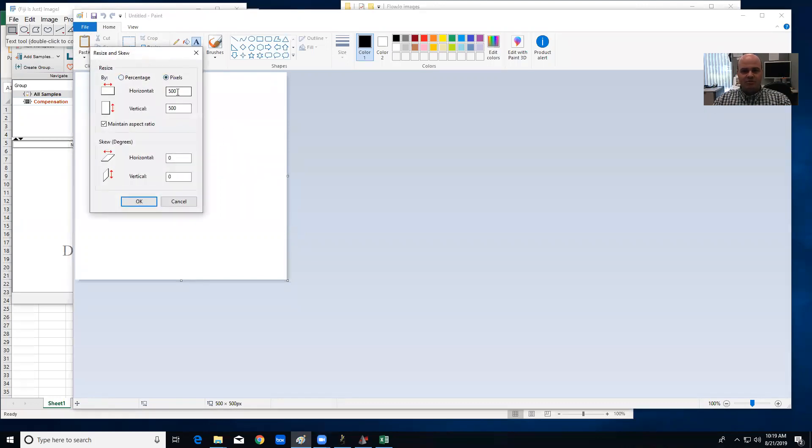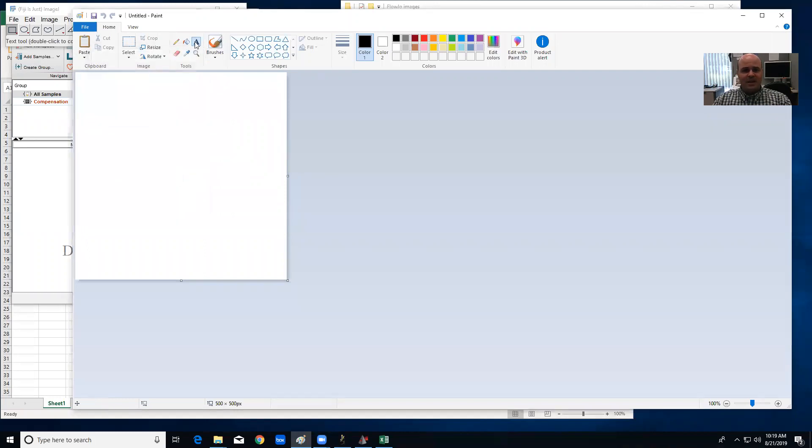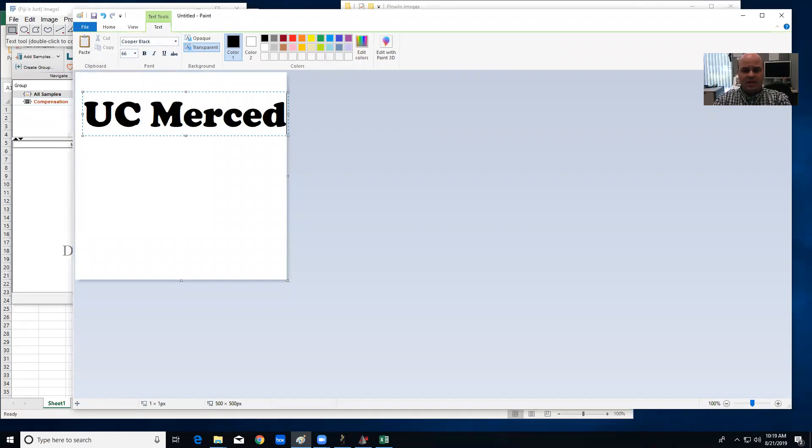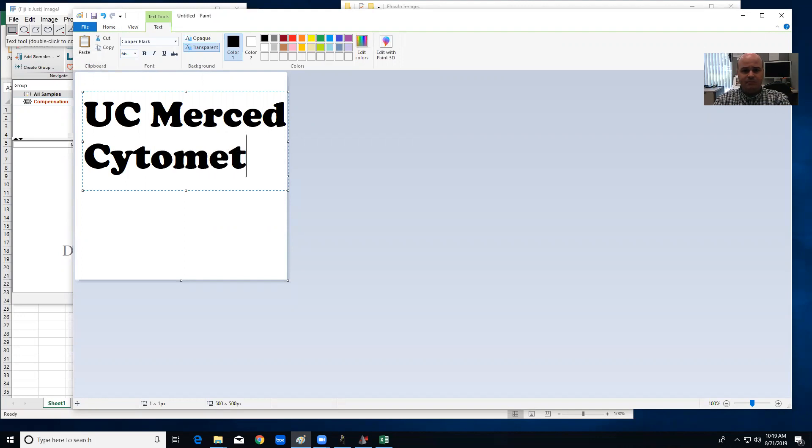So we're going to start in Microsoft Paint and there let's make a new image and resize it to 500 by 500 pixels, and we'll take the text tool and we'll type in some whatever text you want.